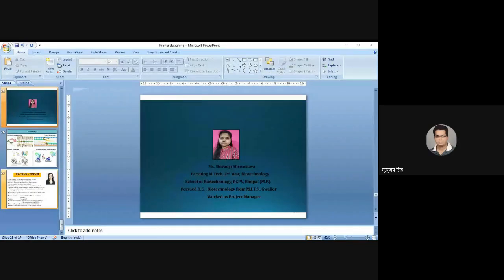We already discussed the degenerate primer: if another species makes a protein product, like insulin, and we want to amplify the insulin gene in human, we can use the conserved region of the other species to form the primer pair for the human insulin gene. It may not succeed in the first attempt. You must choose many different primer pairs to amplify your PCR result in the best way, and use gradient PCR also to find a suitable annealing temperature.